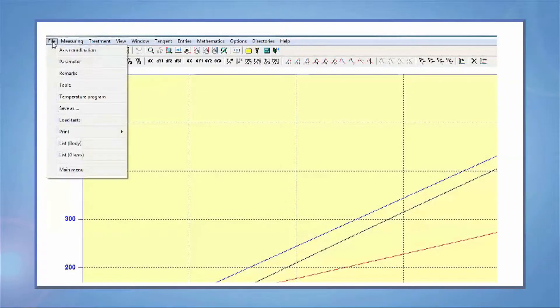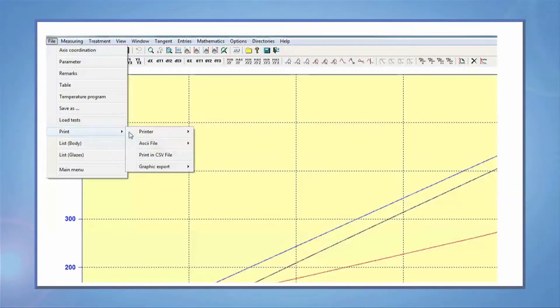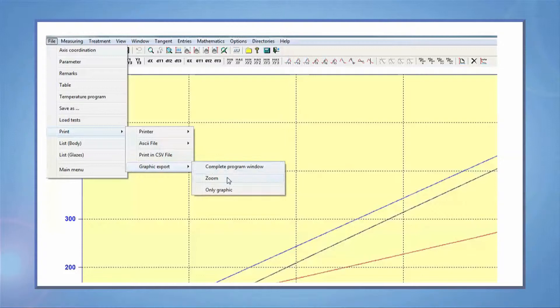For exporting the graph, pick export graph and you will have options such as complete program window, zoom, or only graphic.